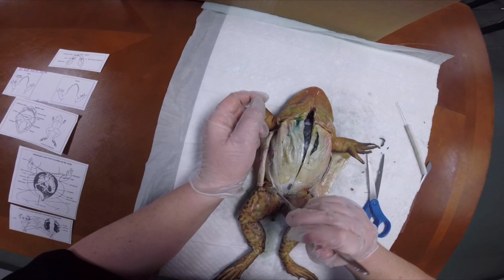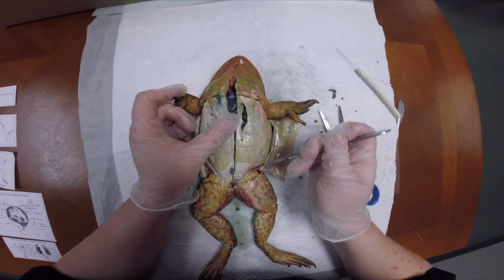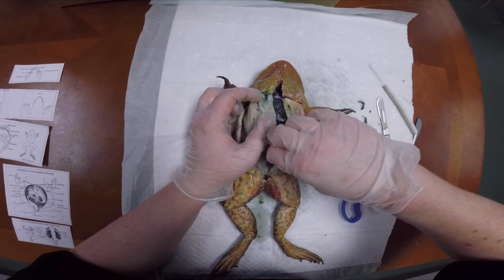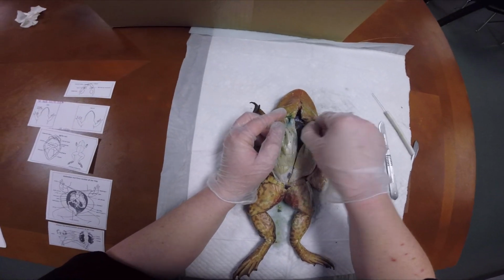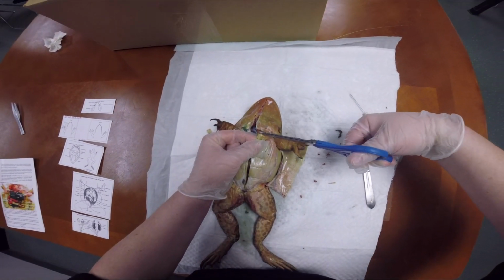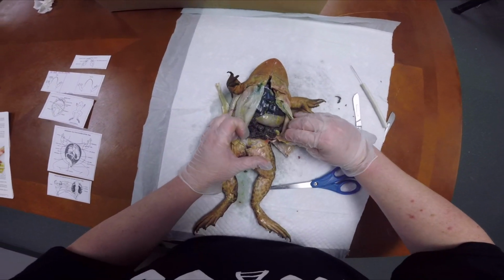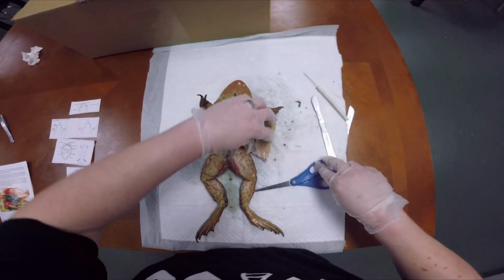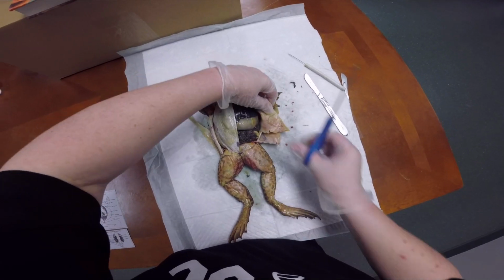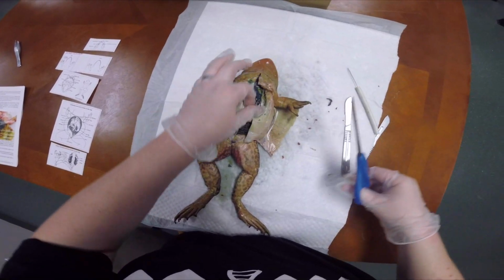Okay, so then I'm going to go and retrace my cuts from the arms right here to kind of get in there. And then I'm going to retrace. I went a little low on the legs, so I'm going to go up a little bit higher and retrace up here. And then I may need to get my scissors because this one has a big muscle wall. Okay, so once we get that muscle wall out of there, we will be able to see the insides. So, more blood veins. You can see them there. This one's a tough customer.